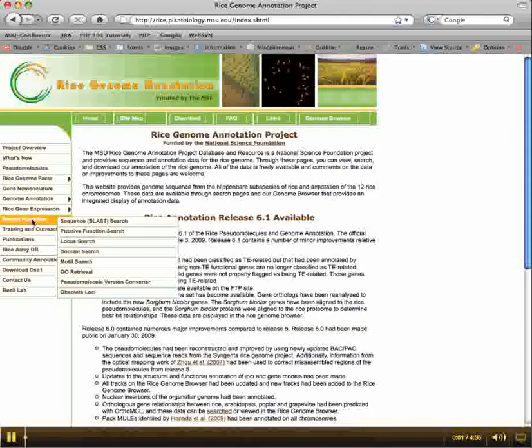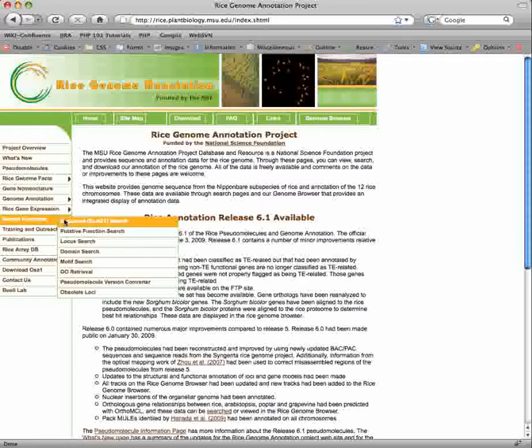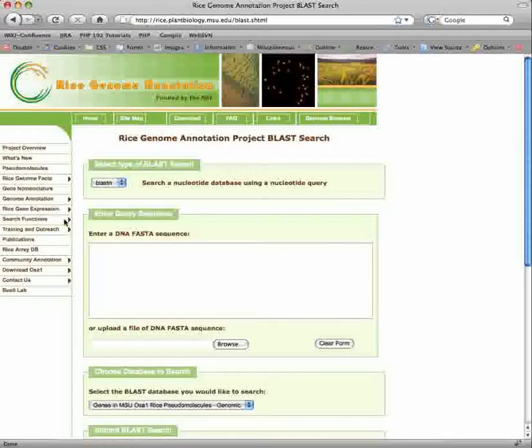We provide multiple methods to search the rice genome, including by annotation, protein domain and motif, and sequence similarity. Let's start with sequence similarity.